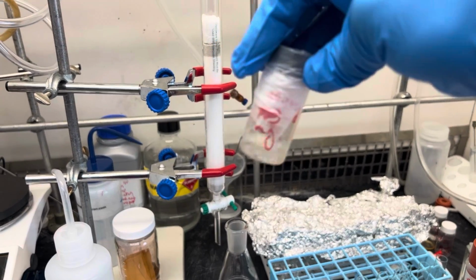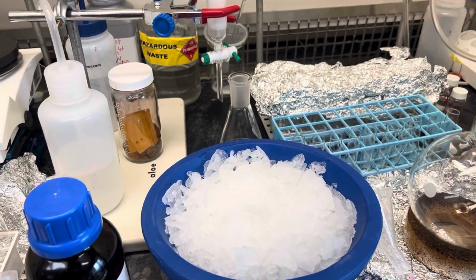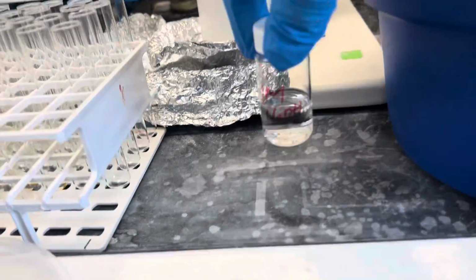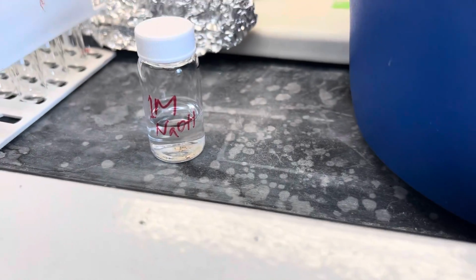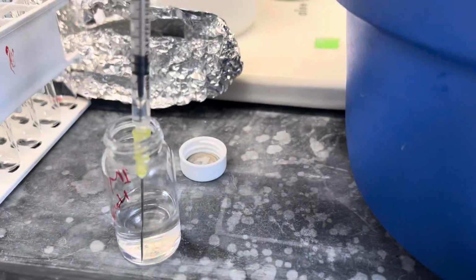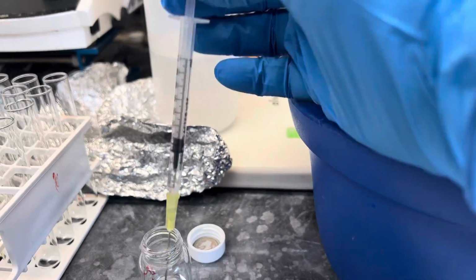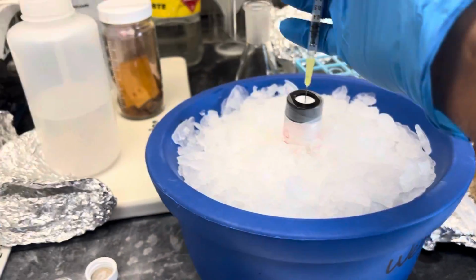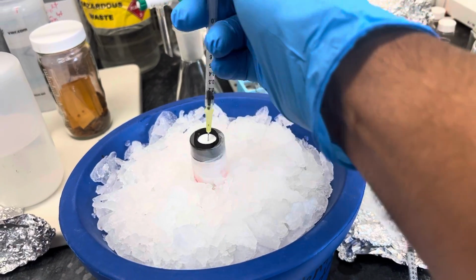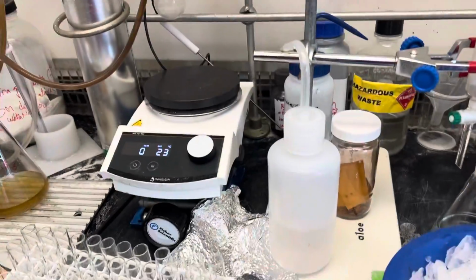Once it is dissolved, I will put it back in the ice. Then I'll take 1 molar sodium hydroxide solution, pre-made, which I made before. This scale is around 100 milligram scale, so I'm going to use 0.1 milliliter or 100 microliter of the 1 molar aqueous sodium hydroxide solution, and I will add it while the vial is in the ice. After addition of sodium hydroxide, I'll keep stirring overnight at 0 degrees Celsius.